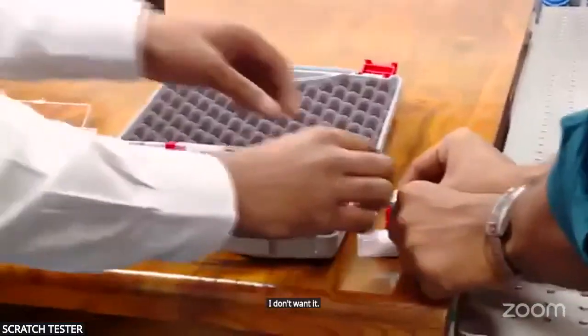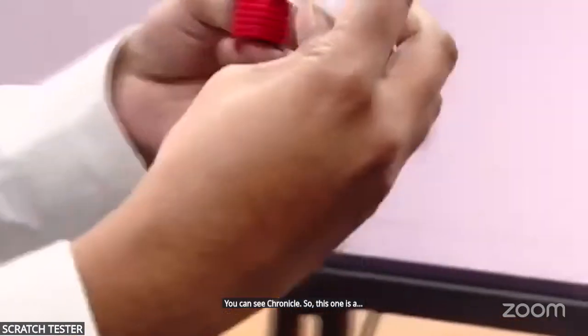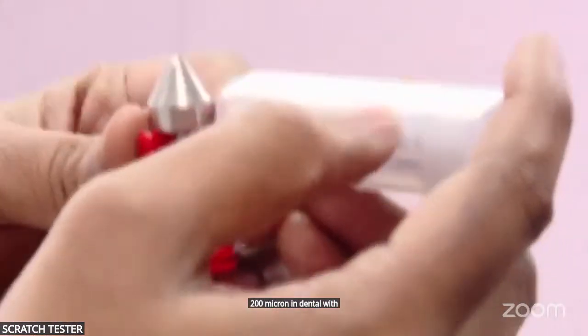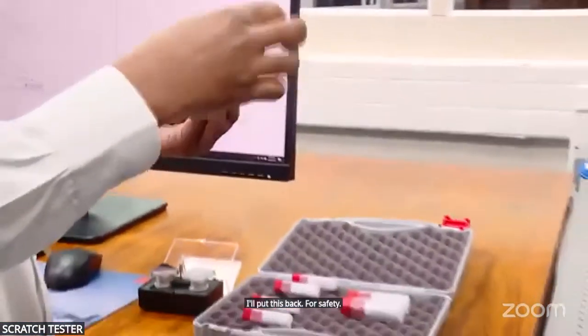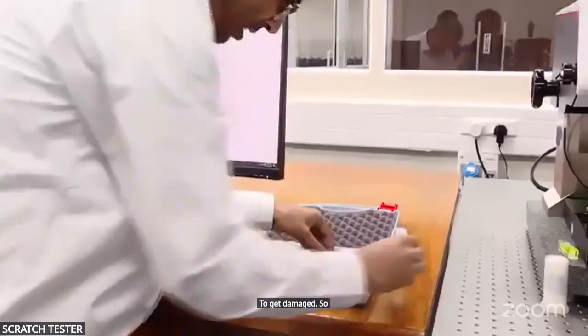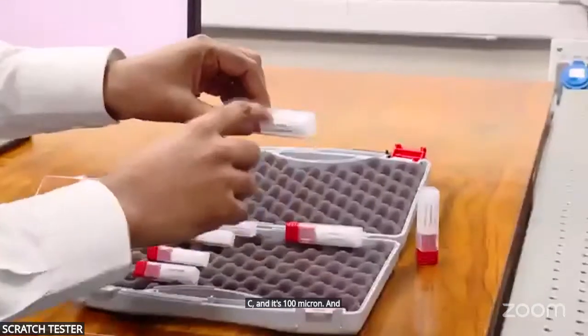So here what we have is the Rockwell indenter. This one is a 200 micron indenter, Rockwell C. We can see its alpha angle is also 120 degrees. I'll put this back for safety. We don't want it to get damaged. Similarly, you have another Rockwell C, and it's 100 micron, so basically we have two here.